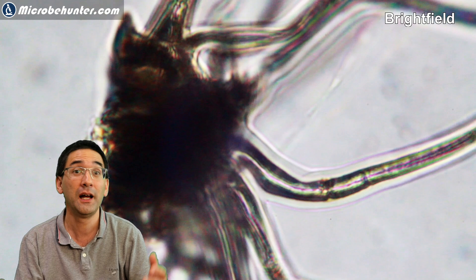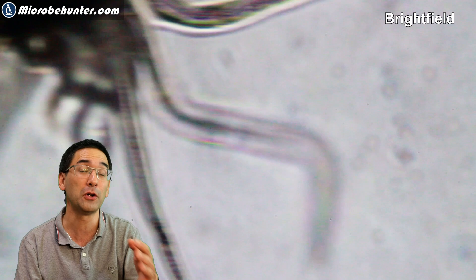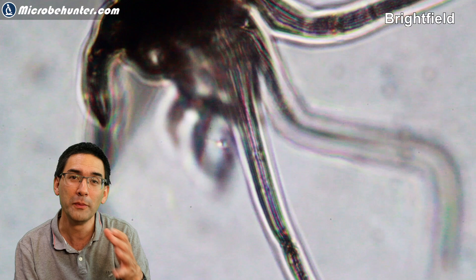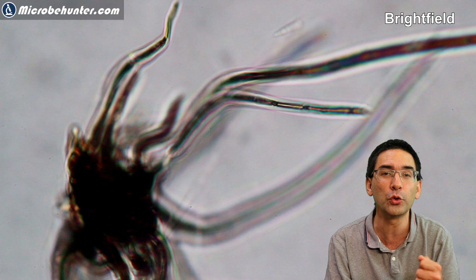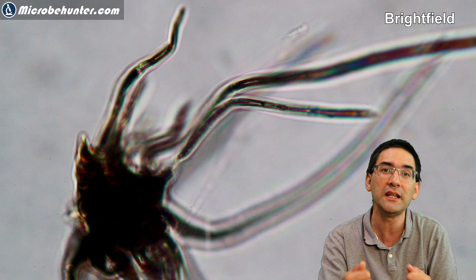You can see there are a variety of different purposes for trichomes, and therefore a variety of different shapes. Because they're fairly large, I used mostly low magnification — up to around 400 times total magnification. When you zoom in, you can see that the branches seem to be hollow, and indeed many trichomes do not contain any living cytoplasm.